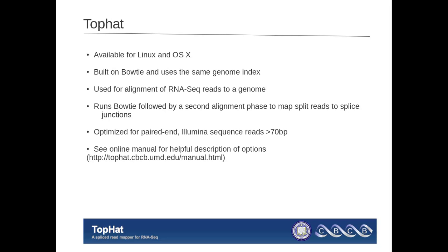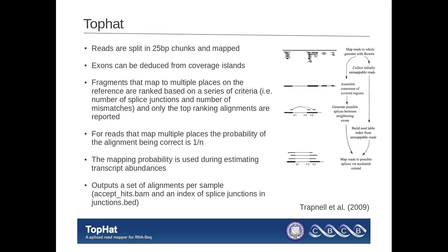You may have read that in the Trapnell et al. paper, which has been assigned for you and is available on the course site. In this Trapnell 2012 paper, they basically argue that it's best to have TopHat try to naively infer the transcripts that are supported by the data, and not to rely on an already existing genome annotation. The primary reason for that has to do with the fact that a lot of transcripts have yet to be discovered, even in humans and mouse, and some of the better annotations that are out there. Any one RNA-seq data set may in fact discover a number of new annotations. I'll come back to this issue in a moment.